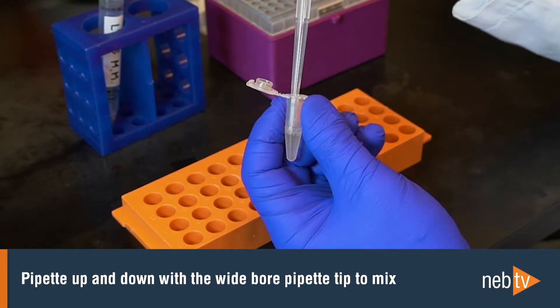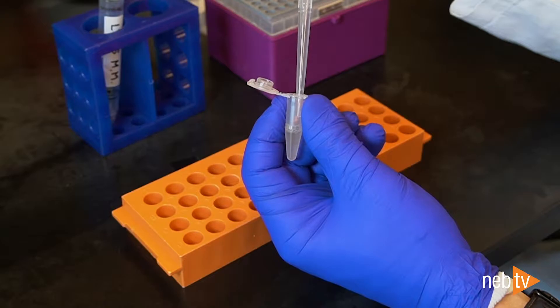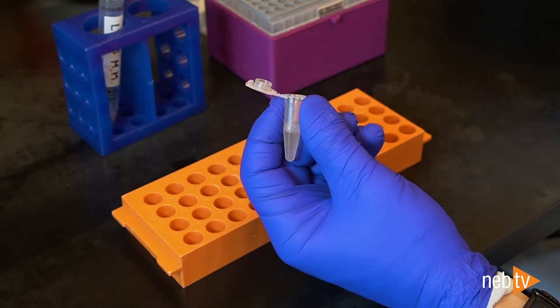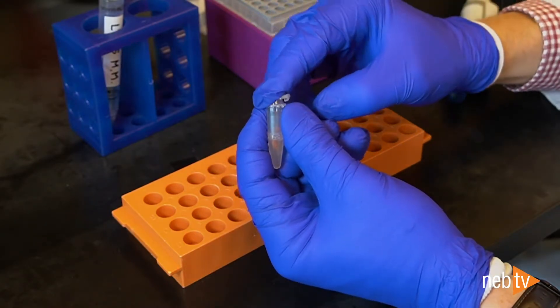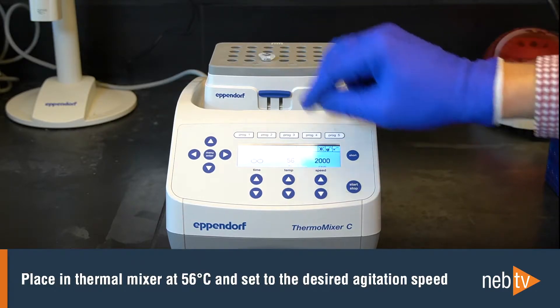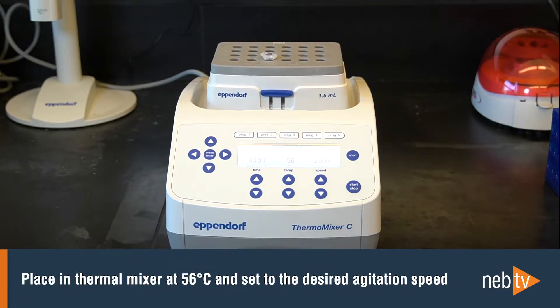In this example with mouse kidney powder, you can see that after homogenization, the lysis is very close to being complete. Discard the pipette tip and immediately place the sample in the thermal mixer set at 56 degrees Celsius at the appropriate agitation speed to begin lysis.